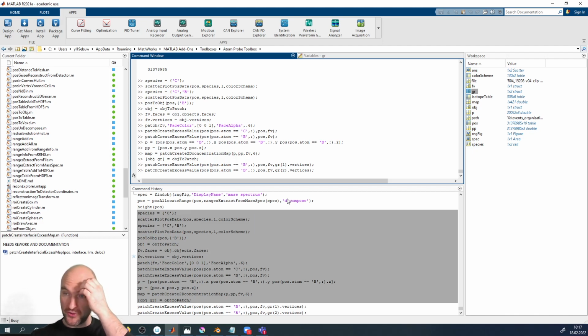We're also going to throw in a function that allows you to pull out the subvolume that's associated with your local value, so that you can use all of the other funky stuff that I've showed you earlier with chopping up your data set and things like that.